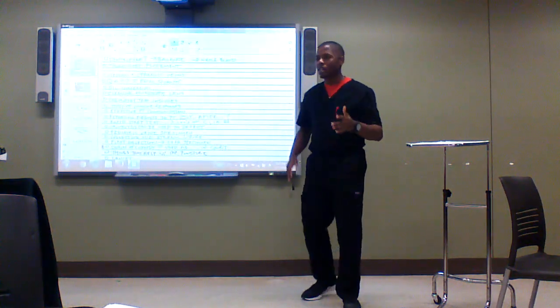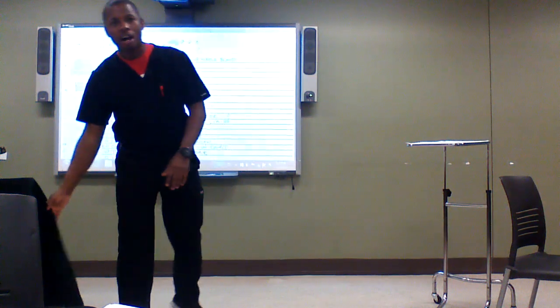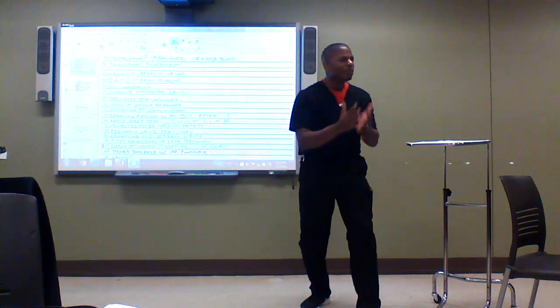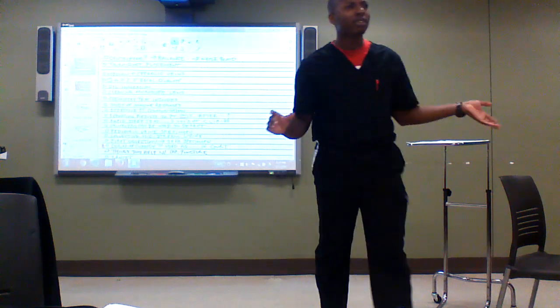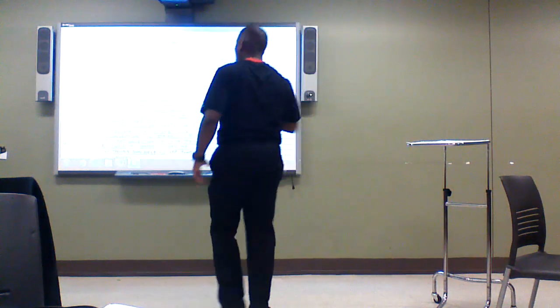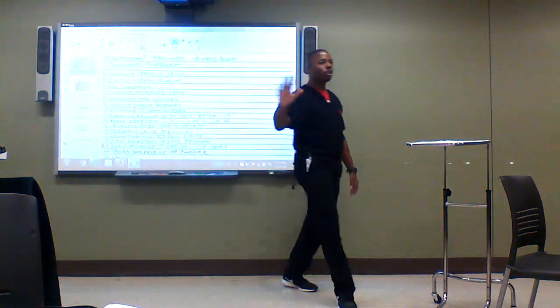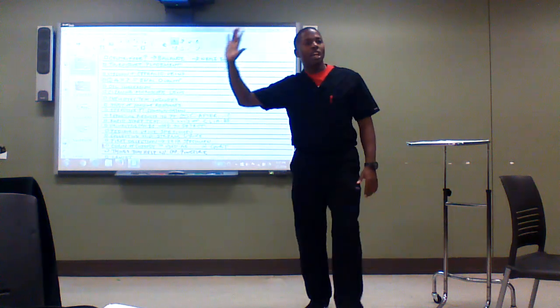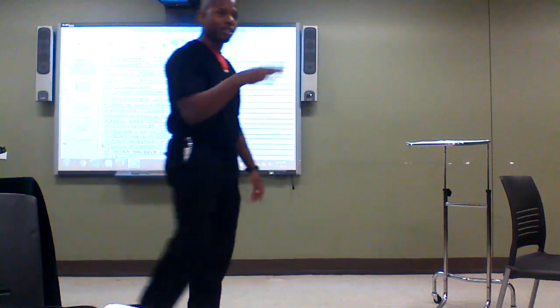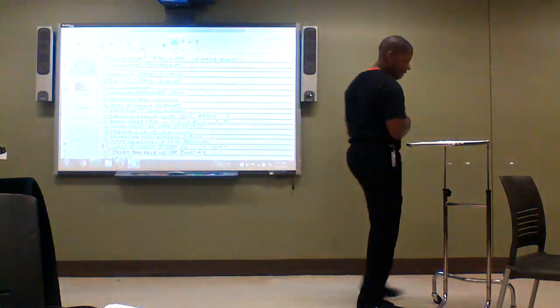If I use my jacket to clean it off, and then one little dot is left, when we magnify times 100, that little dot looks like, oh my God, it's Godzilla or something. So that's why we want to use something that leaves no residue, that leaves nothing behind. Sometimes you wipe something down and it leaves little white stuff behind. We don't want that. Okay?